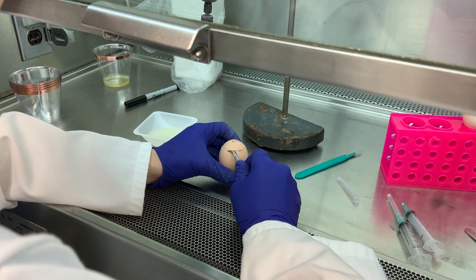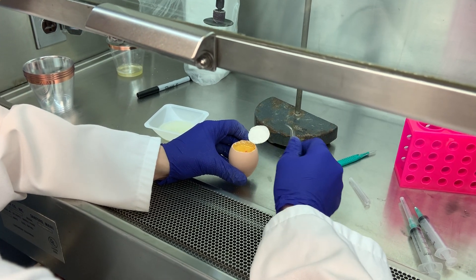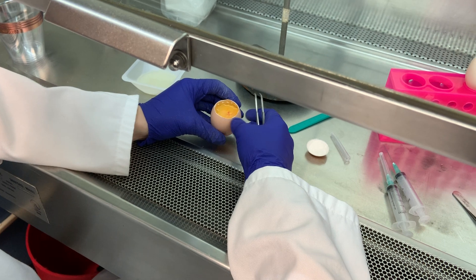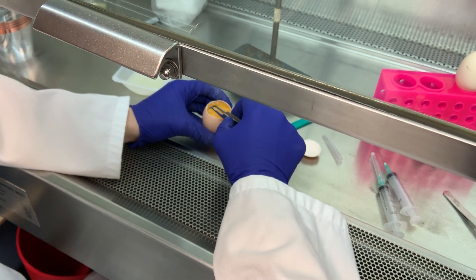Using the tweezers, tear that membrane a little bit, open up the eggshell flap, and that red embryo in there indicates a fertilized egg.